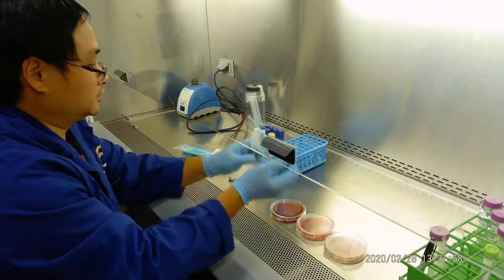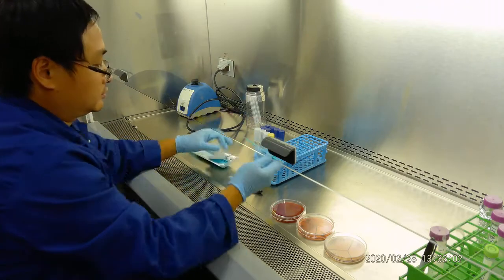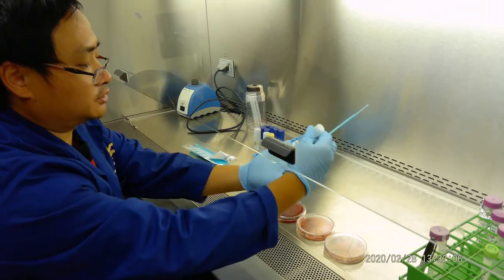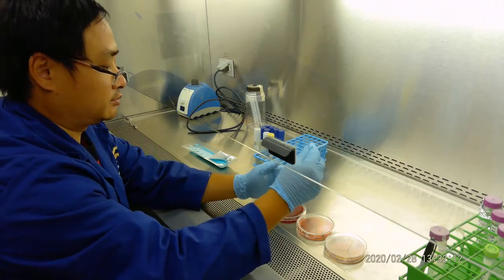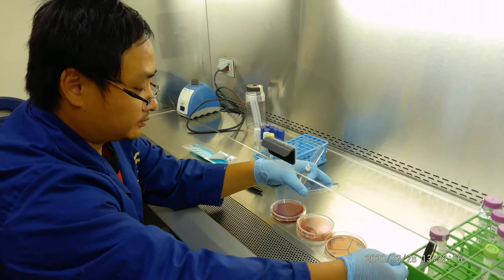And the last one we will do is Pseudomonas aeruginosa. So use a loop. You have Pseudomonas aeruginosa. Now make sure with this one you shake it a little bit. Okay, before you do, make sure you shake a little bit. Sometimes the bacteria is at the bottom, so you get Pseudomonas aeruginosa.